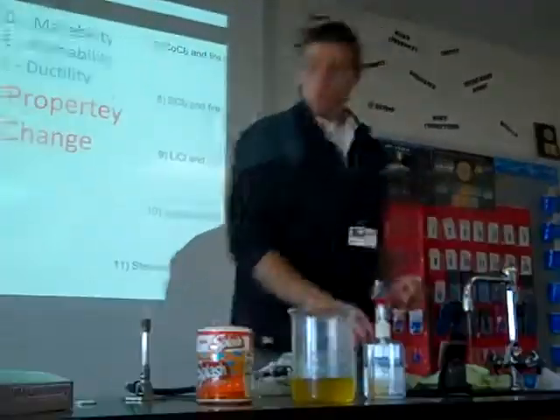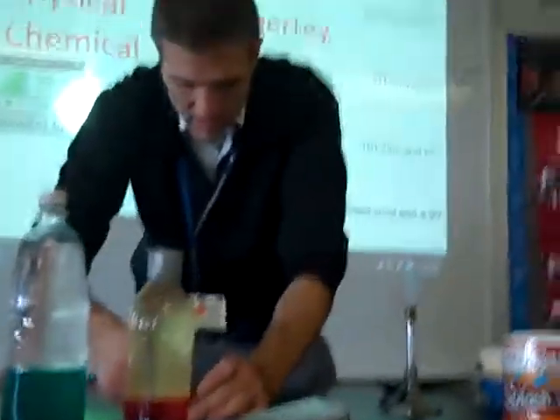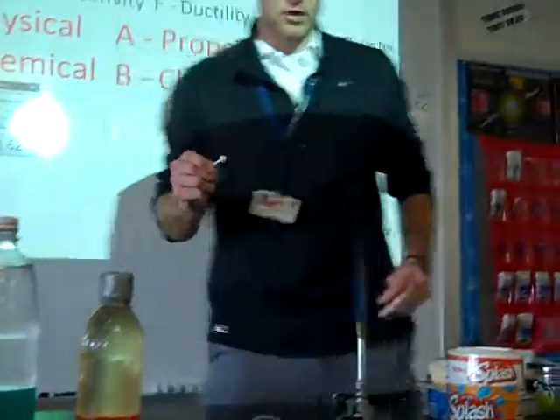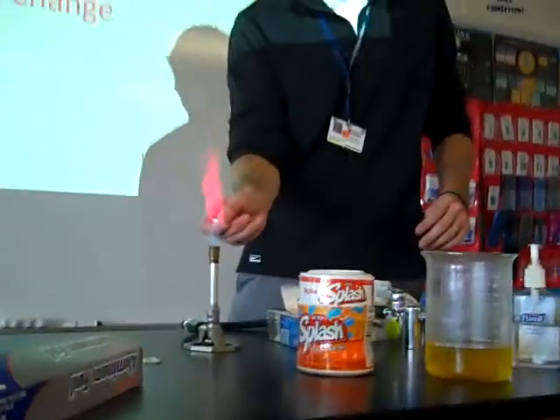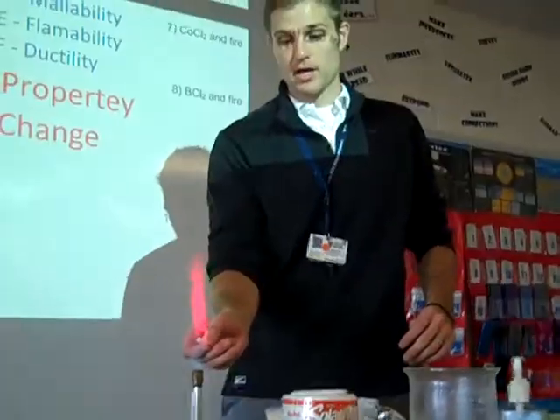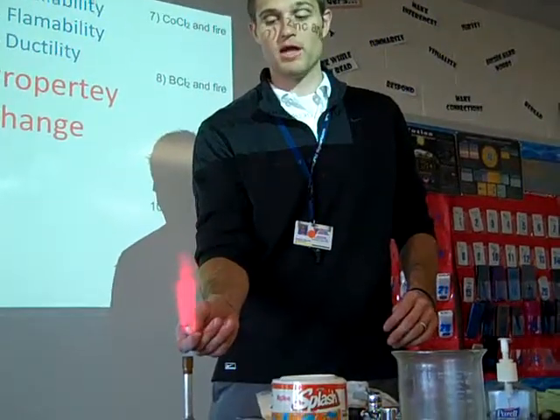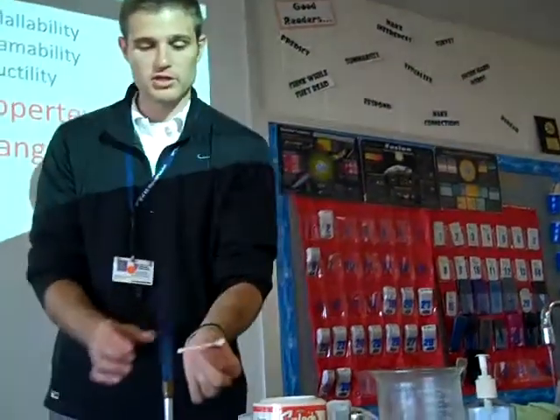Okay. Wet Q-tip, I'm going to get some lithium chloride on this one. Okay, so I get it on. Let's see. Make sure you really watch closely. We're looking for a different reaction. Whoa! Okay. Yeah, awesome. So on the count of three, tell me what you think, physical or chemical? 1, 2, 3. Chemical! Chemical, definitely a different color change.